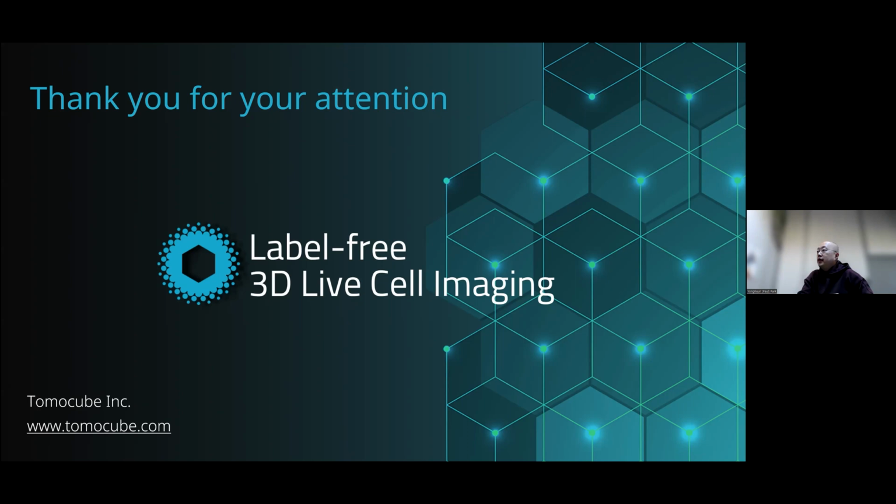I think the DJ has already replied, but in addition to the DJ's reply, I'd like to add that there are several options. As the DJ has explained, there's an option to slightly move the stages in order to change the medium and perform the additional measurement for time-lapse measurements, or you can just move back and forth between our imaging microscope and the external incubators.